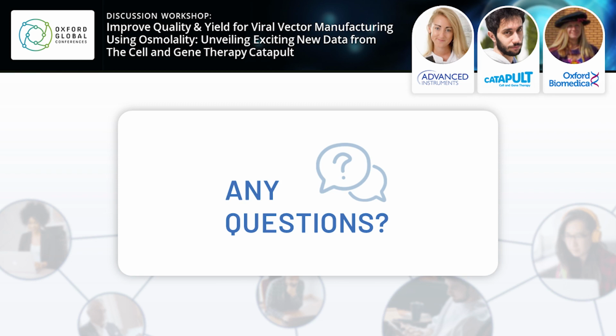Kendall, I have another question here, which may be our final question, and perhaps applicable to both you and Adrian again. The integral data integrity management features of the osmometer were mentioned. Can the panel discuss the requirements for data integrity in their workflows? Is there any concern regarding data integrity?